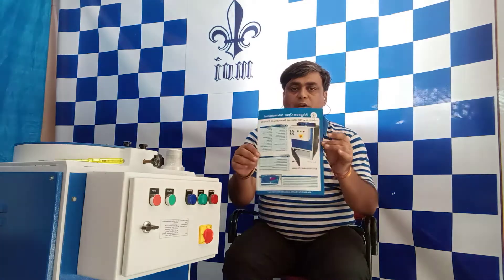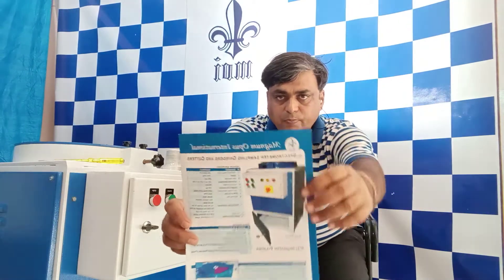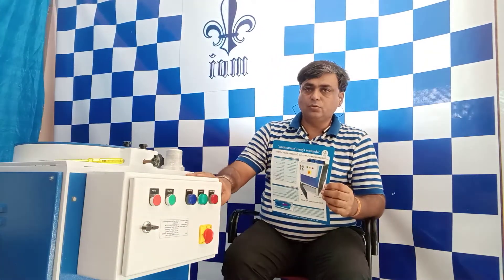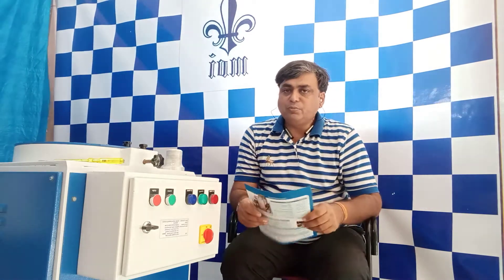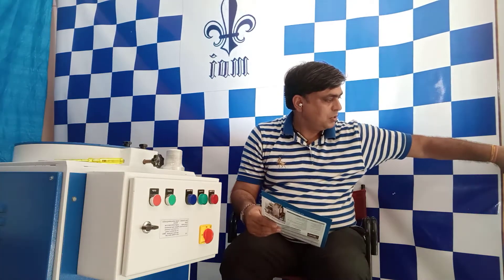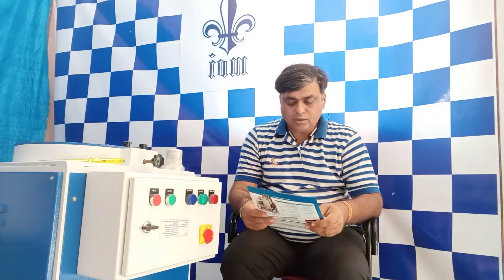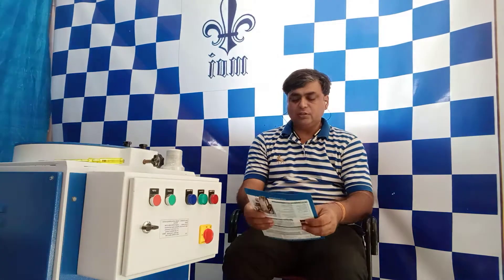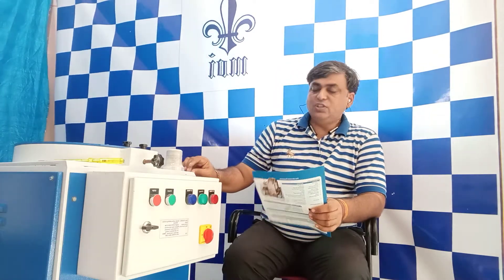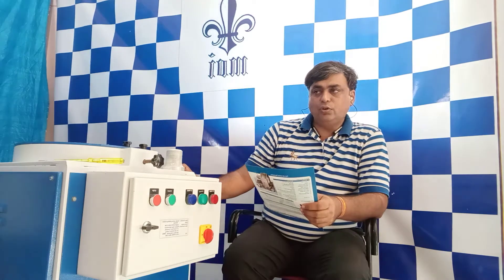If you could have a look at this catalog, this is exactly the machine you can see here. Now if we compare the machine features and start with the technical specifications: this is presently one of the best technically superior machines available in the world today for spectro sampling.